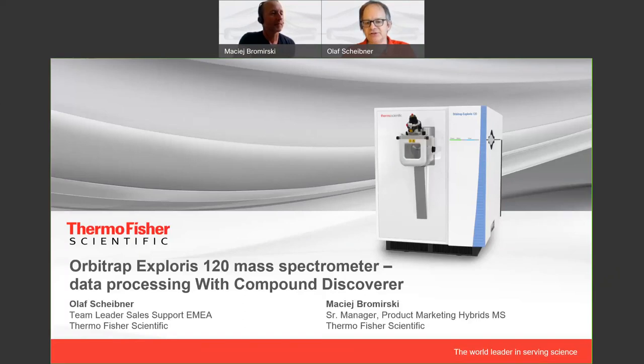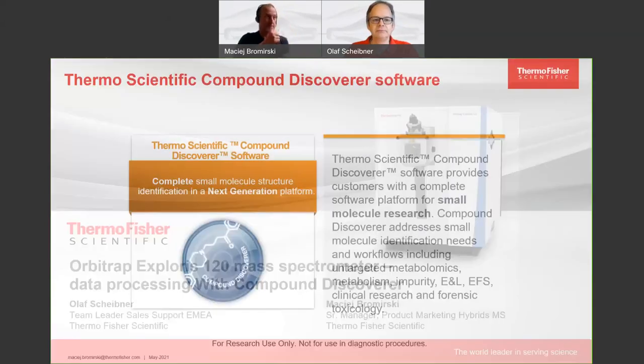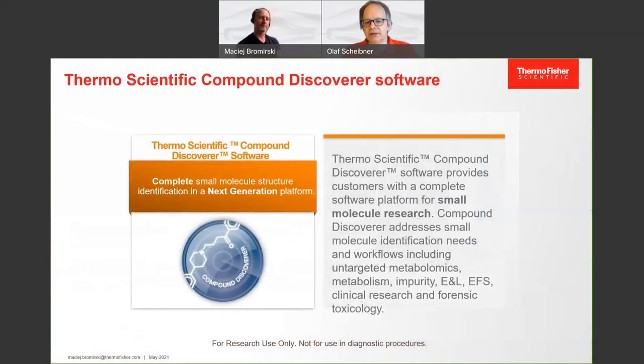Thank you very much, Maciej. In the series so far, we have looked into the instrument itself. We have looked into AcquireX acquisition mode, and now we're looking into the software that puts it all together. So Compound Discoverer, what we are looking at here, is a software platform for small molecule research. And we're looking specifically at the part of non-target screening in the software.